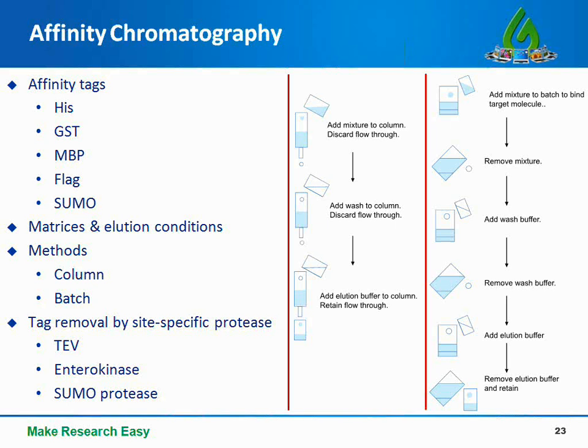Purification can be carried out by either columns or batches, as illustrated here on the right. If you would like protein without tag, the tags can be removed by site-specific protease during the purification step, given that a protease digestion site was incorporated when making the protein expression construct.